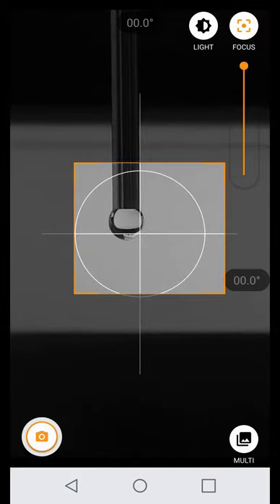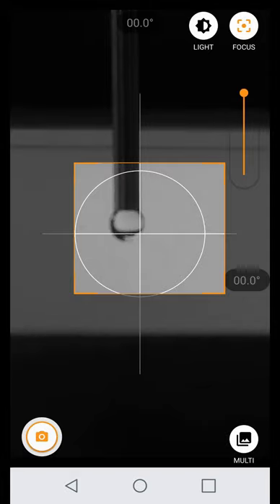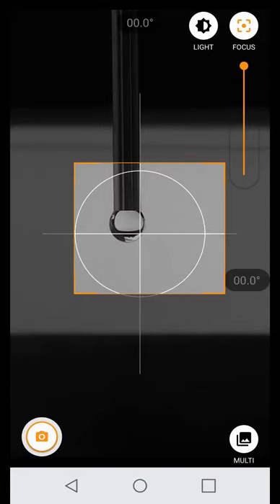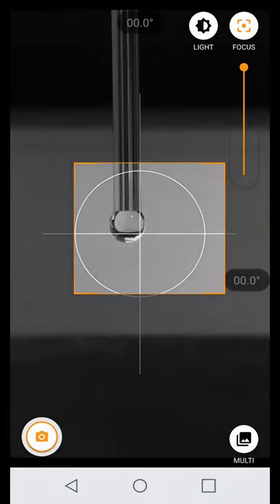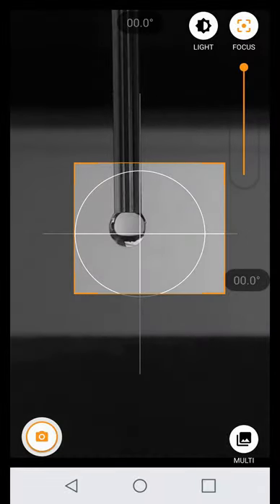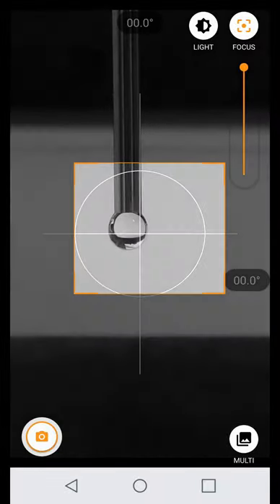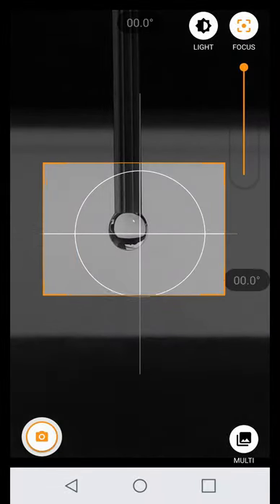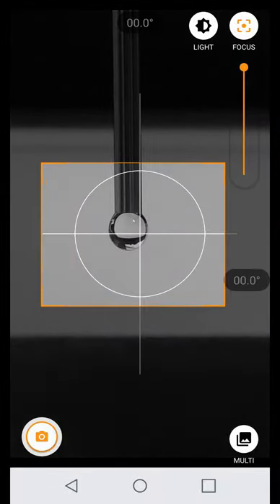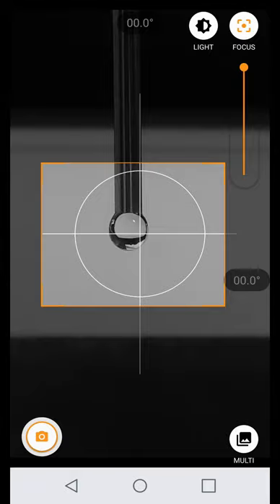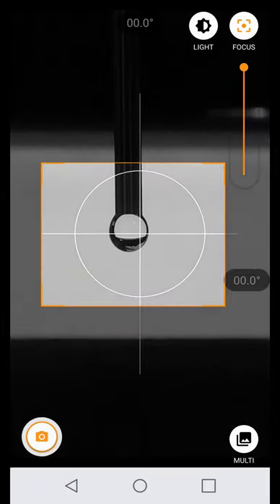Use the focus slider to focus on the droplet. To get the best results, the focus slider must ideally be as close to the top as possible. This can be achieved by adjusting the distance between the phone and the droplet.